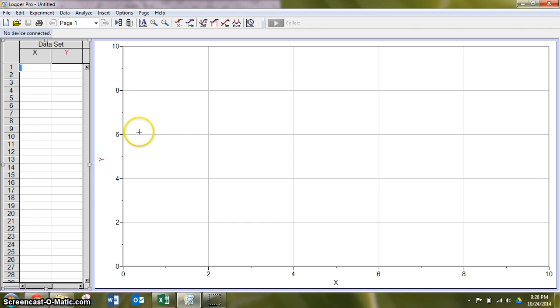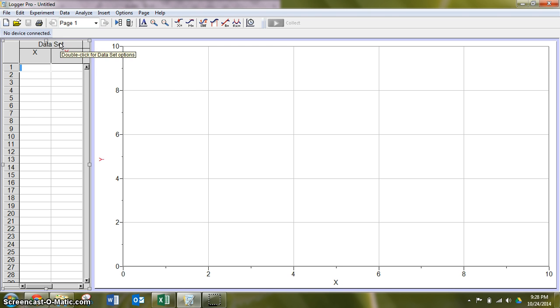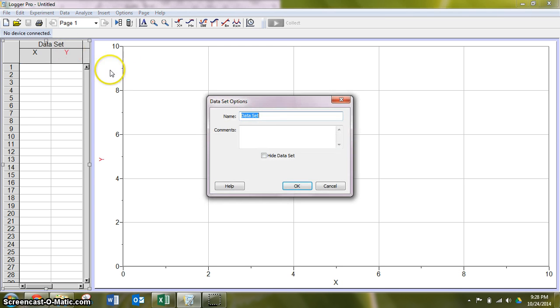Now this graph is going to be slightly different in that instead of having our data sets be based on the strength of the response, we're going to compare two different metals. So I'm going to double click data set and I'm going to type in copper. So this is going to be my data set for the first metal.